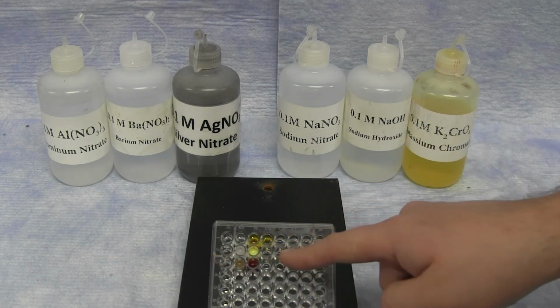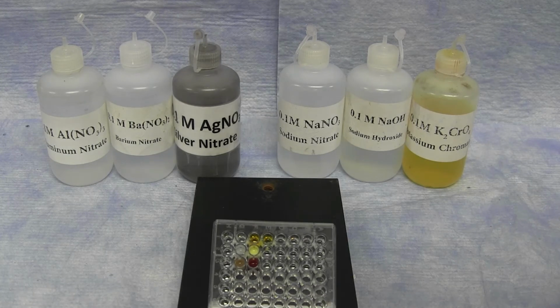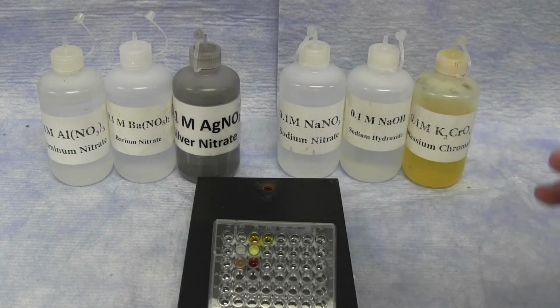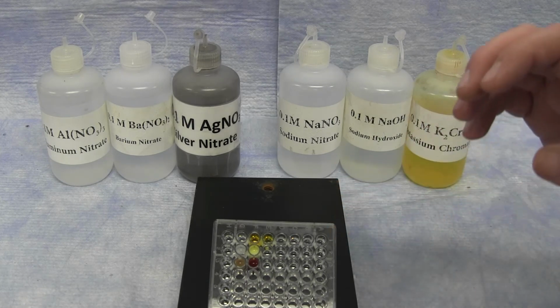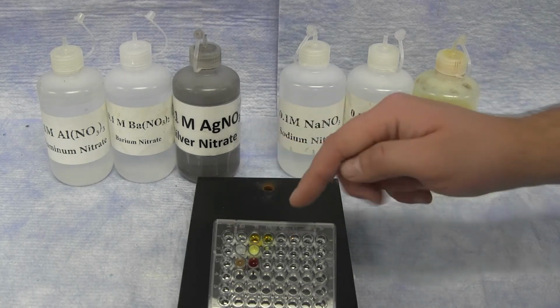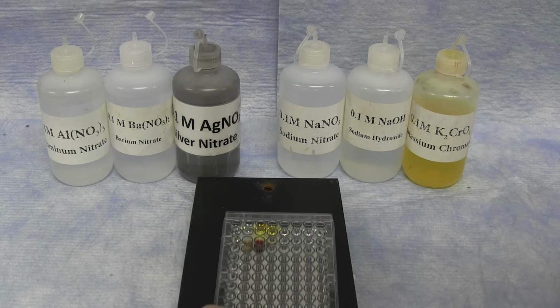However, both the barium nitrate in the second row and the silver nitrate in the third row did react with two different materials. From this, we can see that the aluminum nitrate is less reactive and therefore more soluble than the other two, barium or silver nitrate.